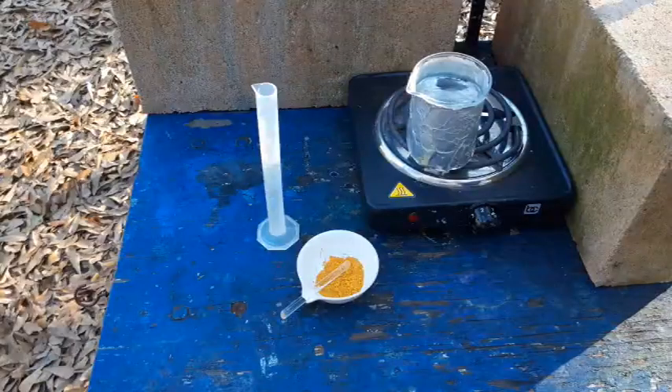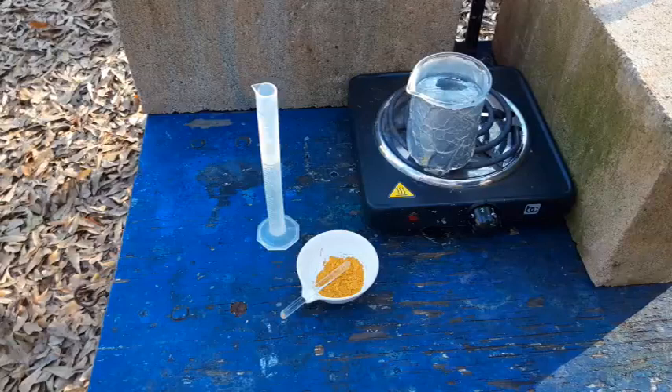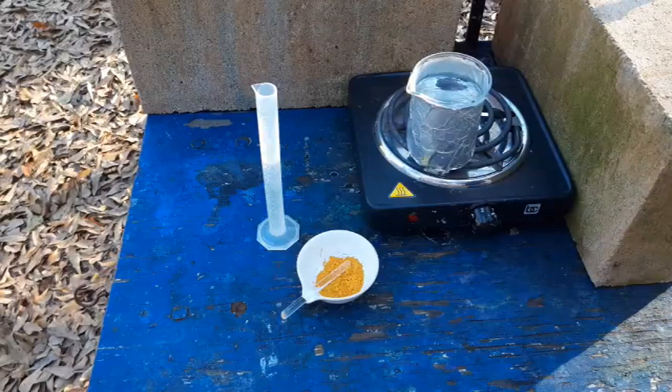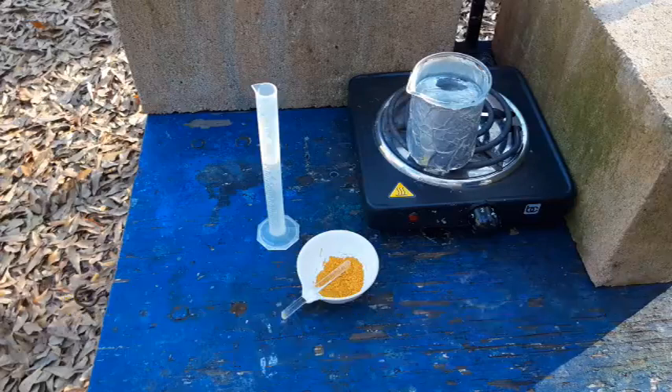Hello everybody and welcome back to the Poor Man's Chemist. In this video we are going to be making mercuric acetate from mercuric oxide and 50% acetic acid. This prep comes from the Handbook of Preparative Inorganic Chemistry and we are doing it at half scale from what the textbook actually gives.